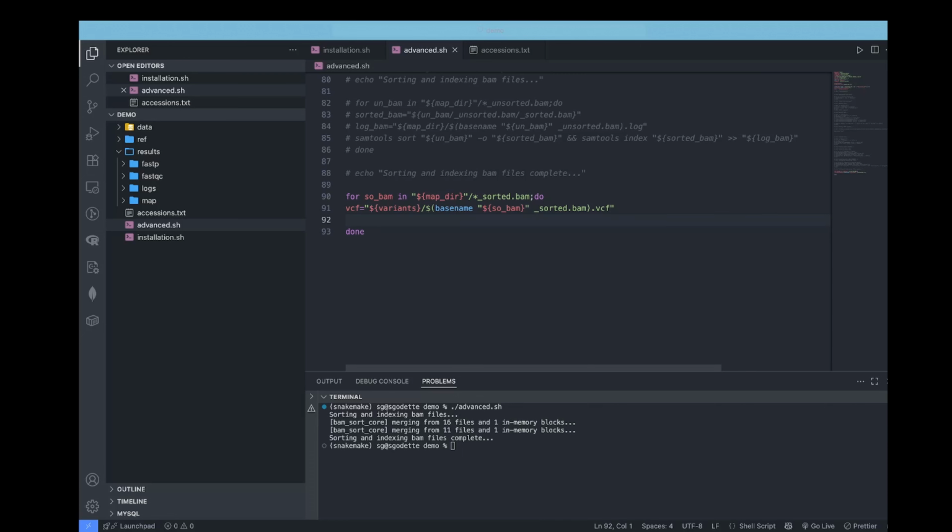And finally write the command for mpileup and the command for variant call. So we want to do mpileup using the bcftools mpileup, and then we want to tell the program that we expect our output to be a variant call file, and also inform it that we want to supply it with the reference file and provide a path to the ref file. And then remember that the input to the bcftools mpileup is the sorted BAM file. And here is where now some level of triviality comes in. We want to pipe the output from this program to a second program. So we use the pipe function of bash script. So we pipe the output generated from the bcftools mpileup to a separate program called bcftools call.